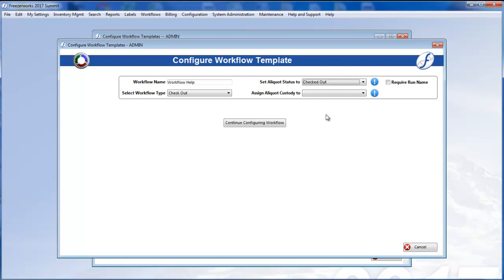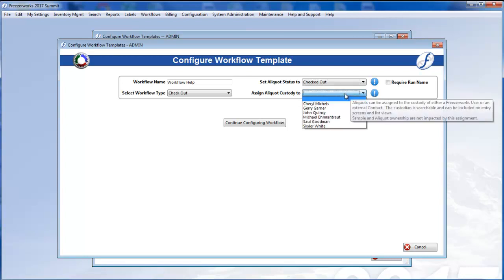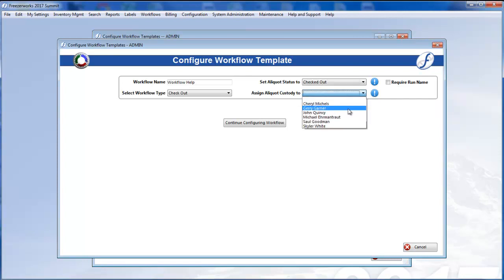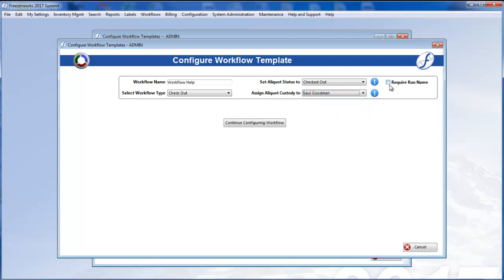The Assign Aliquot Custody drop-down determines the custodian for each aliquot that this workflow is run on. This drop-down gets filled with each people record in your database that was marked as a custodian. Again, see part one if you want more information.